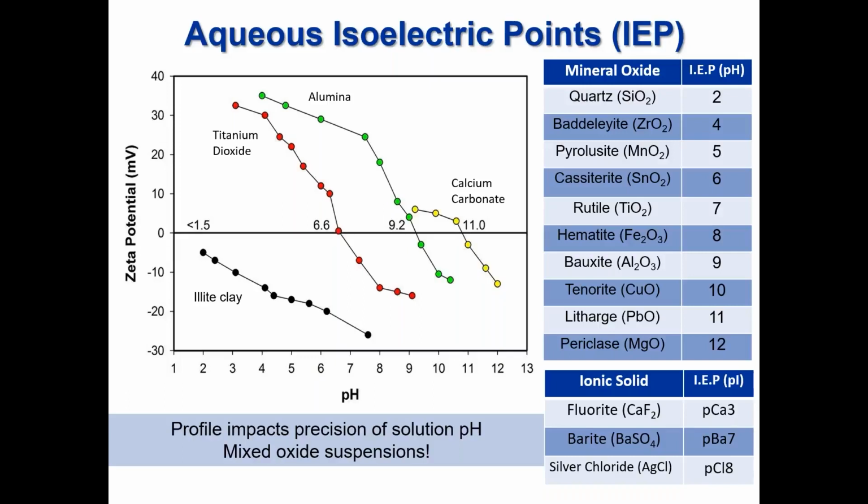This will impact the sintering, of course, of any slurry of those mixed oxides. Of course, you can always get a good dispersion at both lower and higher pHs. But this is not always an option. The best way then to prepare a mixed slurry is to use a dispersing agent, but that's also a topic for another day.